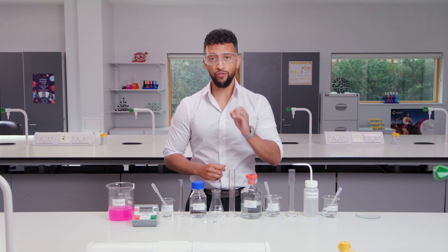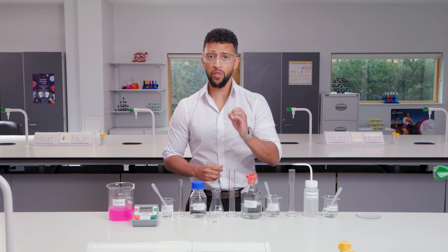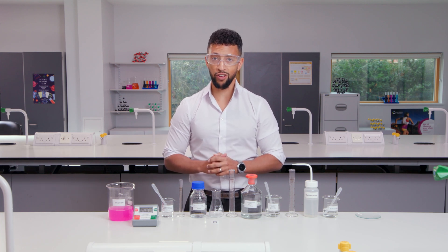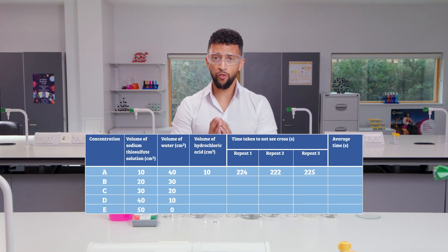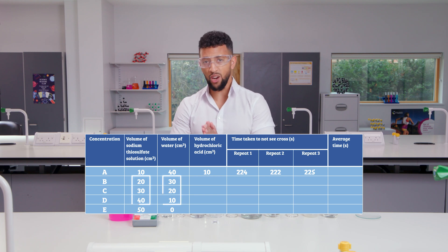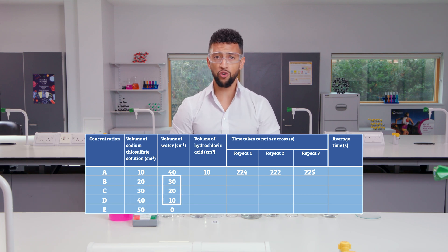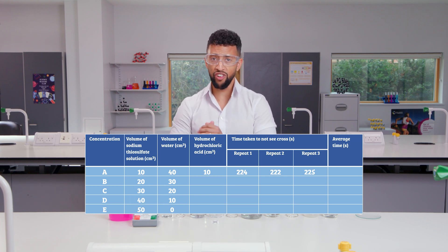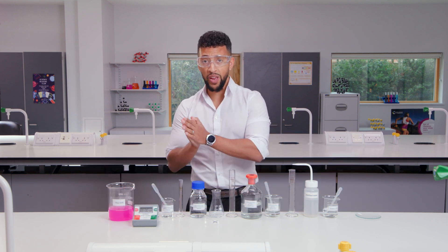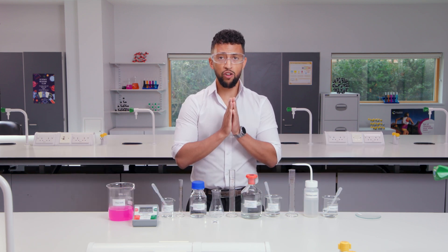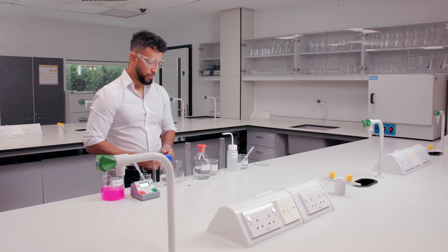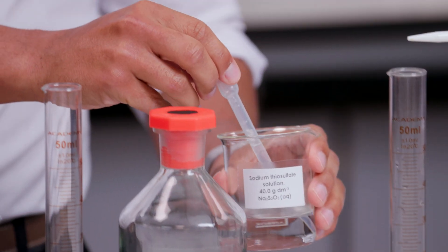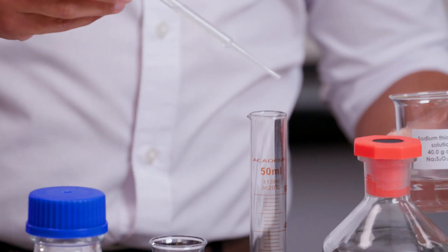We are now going to change the concentration of sodium thiosulfate solution using different volumes of sodium thiosulfate and water to see how concentration affects rate. For concentrations B, C, and D, measure out the volumes of sodium thiosulfate in the results table and add water to make the total volume of sodium thiosulfate and water 50 centimeters cubed each time. Repeat the rest of the steps you did for A, record the times in the results table, and do three repeats. For concentration E, use 50 centimeters cubed of sodium thiosulfate solution and no water.